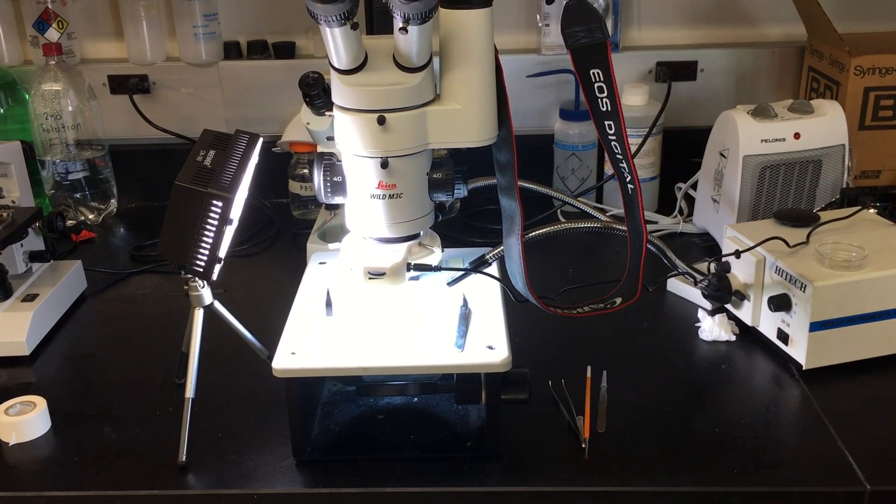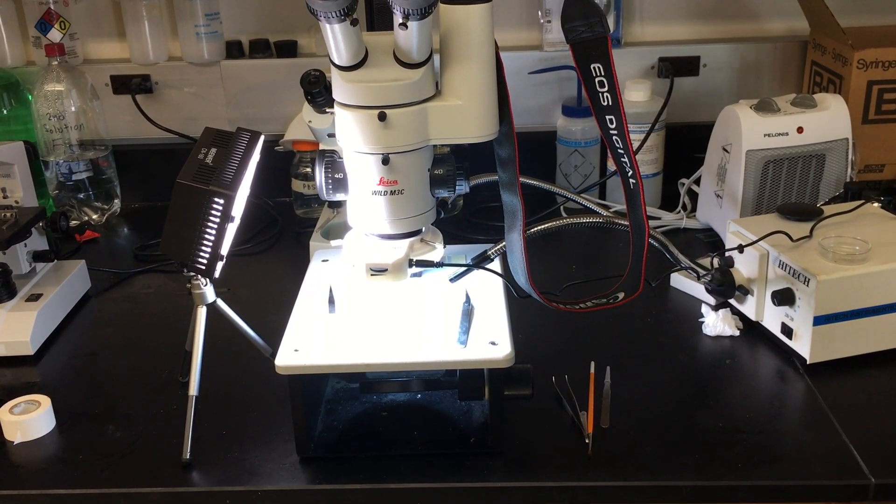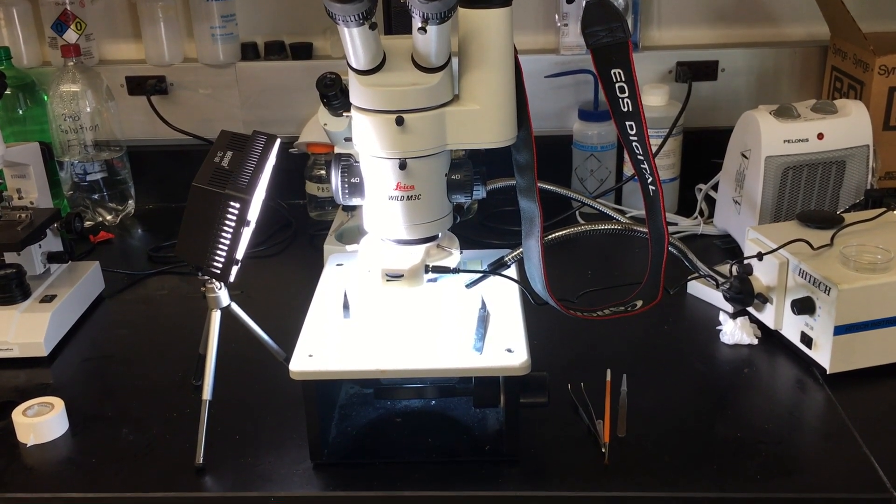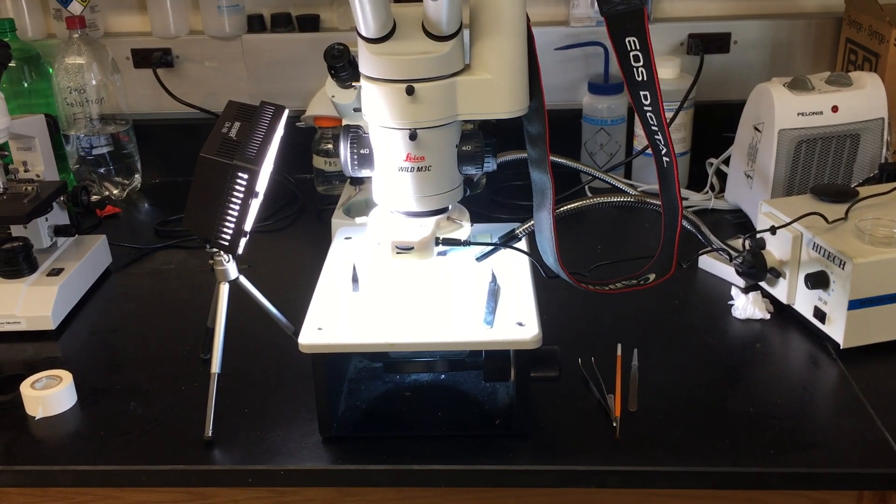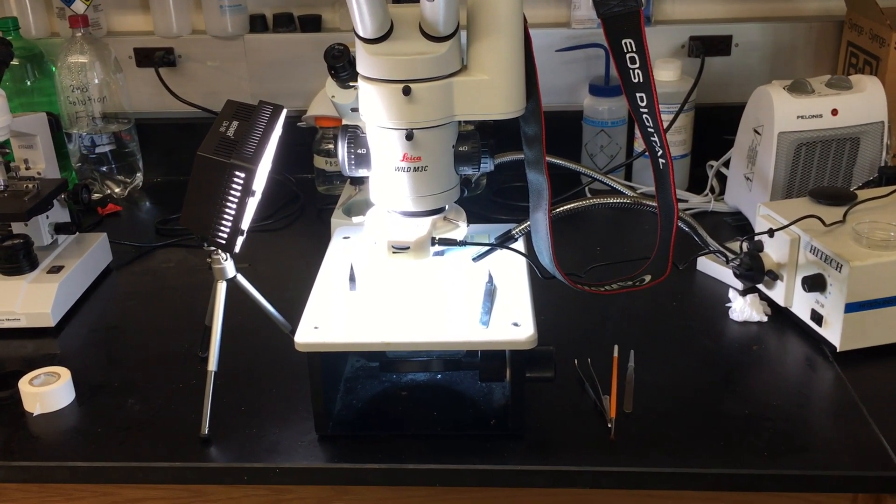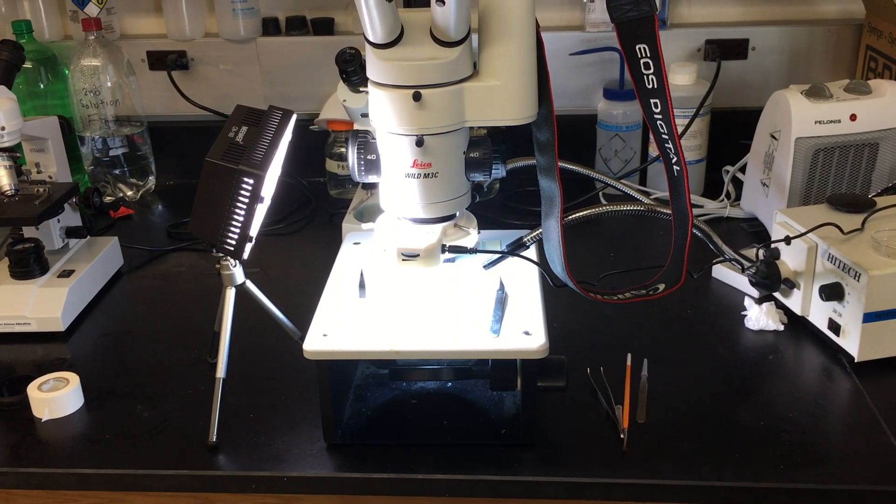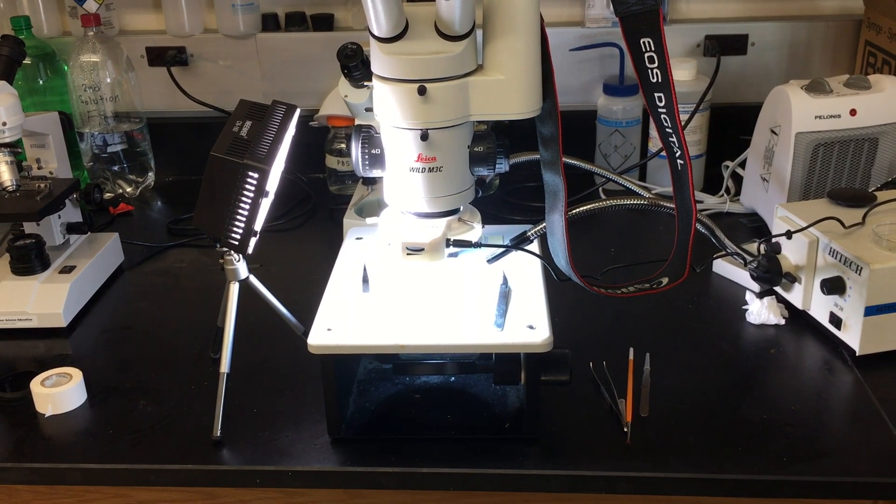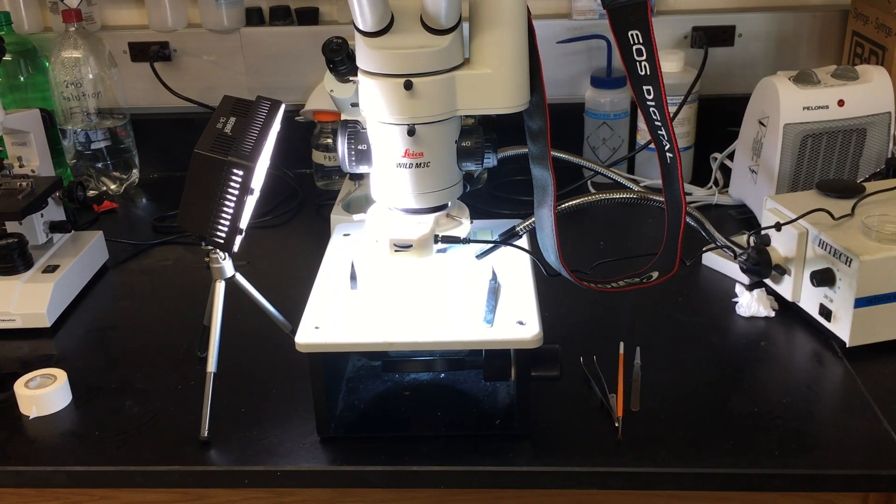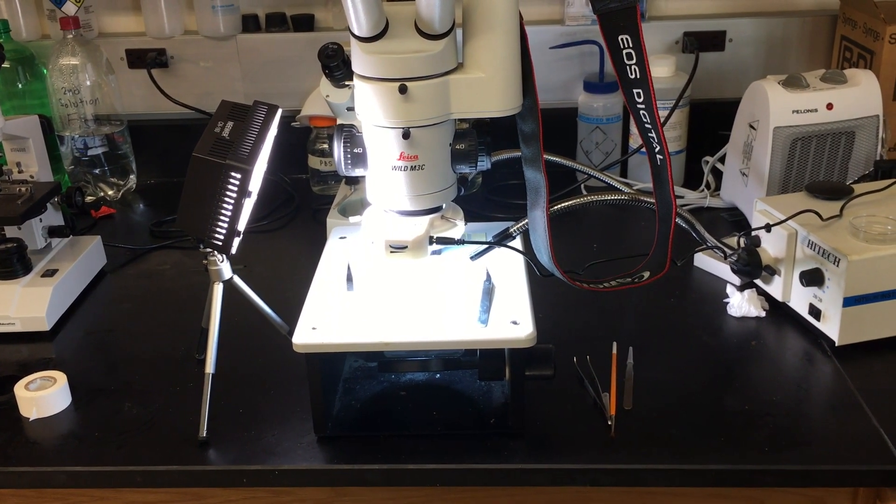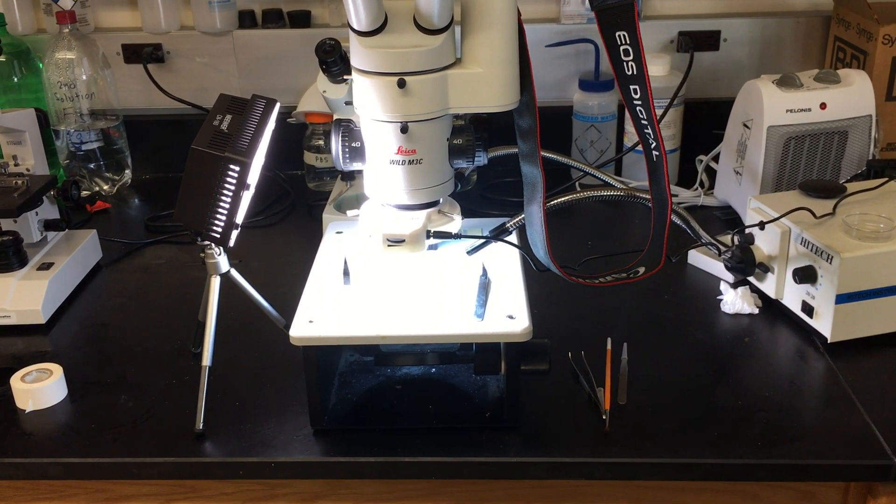This is my Wild M3C dissecting scope, and it's pretty much stock. The only things different are this Amscope ring light attached to the optics, and off to the left there's a bank of LEDs that I use for illumination. I can also use the fiber optic gooseneck to the right, but lately I've been finding these LEDs are just as bright and in many ways a lot better, although you don't get the fine focus of the illumination.